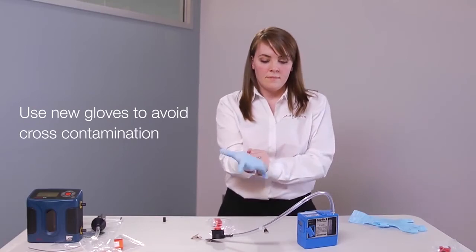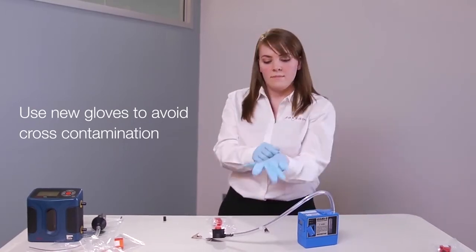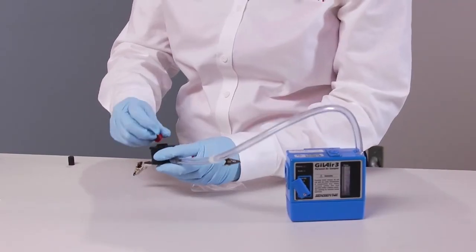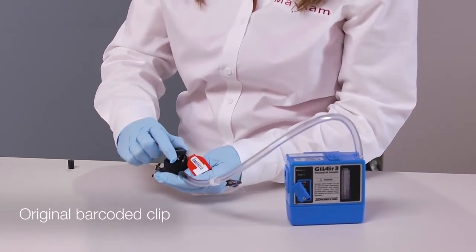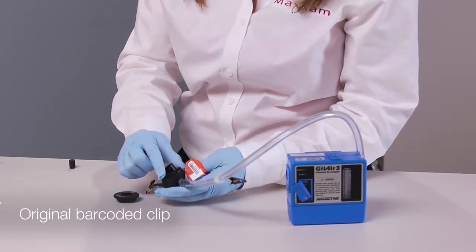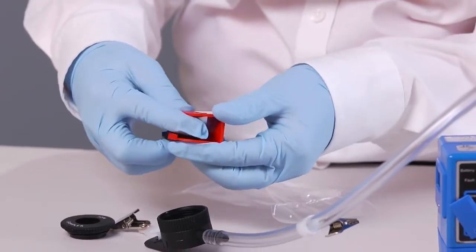Using new gloves between samples to avoid cross contamination, open the faceplate of the sampler. Obtain the correct original barcoded transport clip for that cassette and return it to the original clip and baggie.